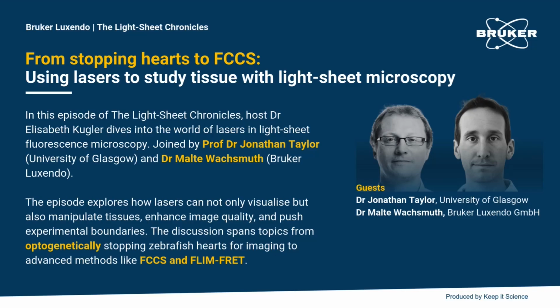But you already brought in so many different things, such as image quality in general and artifacts, how they relate to each other. And you also mentioned Gaussian beams. And so maybe, Johnny, you can add to this and talk with us about how different beam types, such as Bessel and Airy beams, influence the balance between image resolution, penetration depth, and photo damage in light sheet microscopy.